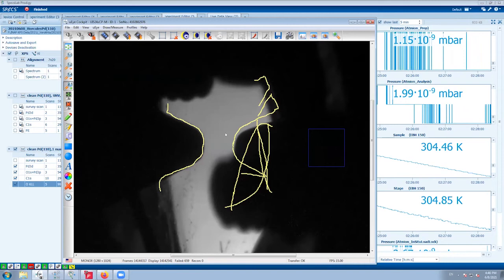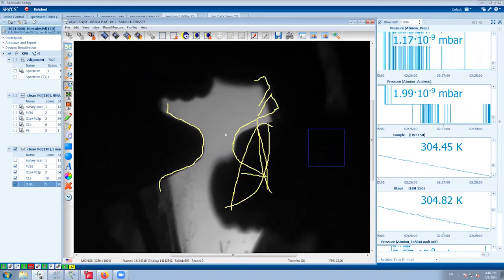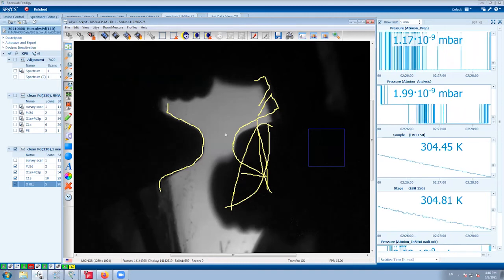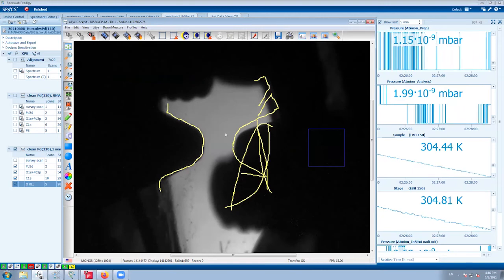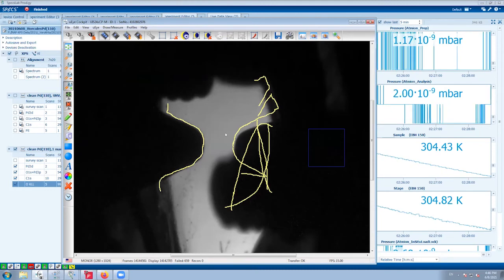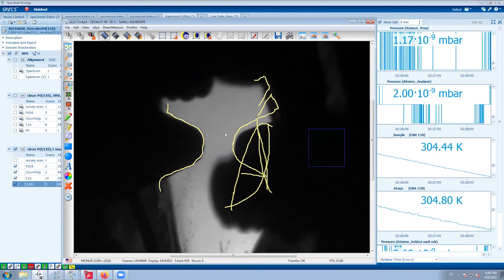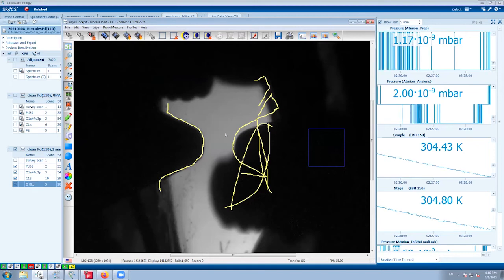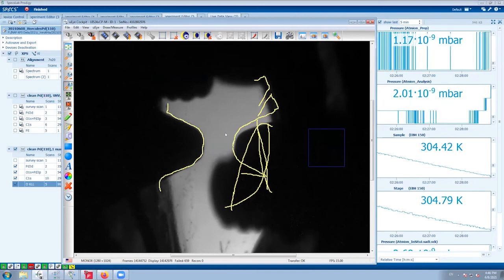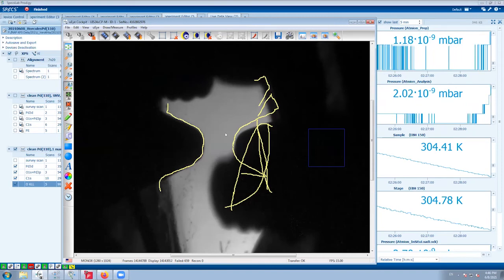On the other hand, if you stabilize the pressure and the temperature, the system is very reliable and it can keep those values for hours without any change. We know that because we did some experiments. This one I showed you, the first example published in Advanced Materials, was the experiment where we were using the X-ray quite extensively. We know that for 8 hours, we didn't change the pressure or temperature since we set it up.